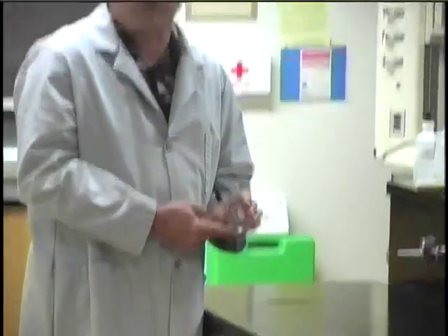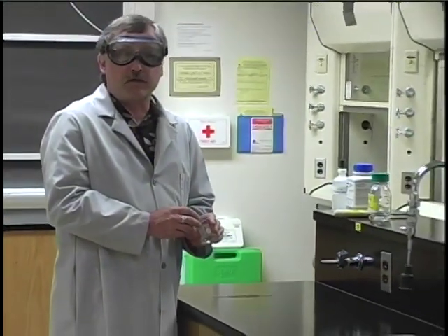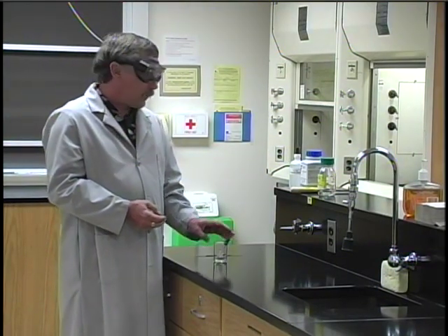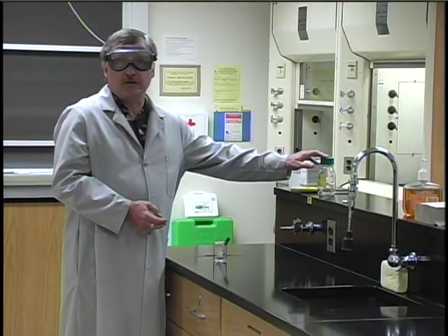You'll have only contaminated that particular portion. If you end up with solution left over after you're done, the best thing would be to give it to another student, but if you can't, you should dispose of the chemical properly. Again, a reminder: you don't put it back in the reagent bottle.